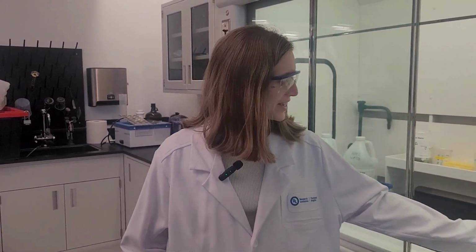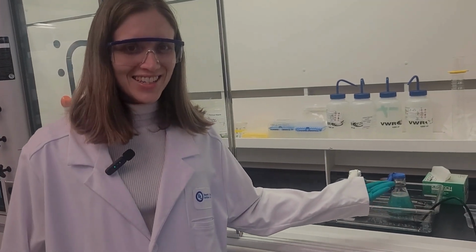Right, so this is our healthy cells. These are our cells with a toxin, so we'll come back in a few minutes and see what happens.